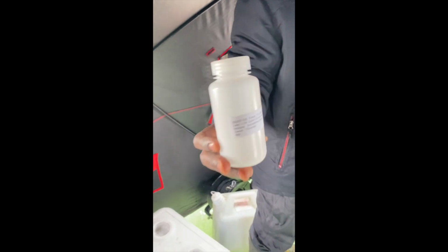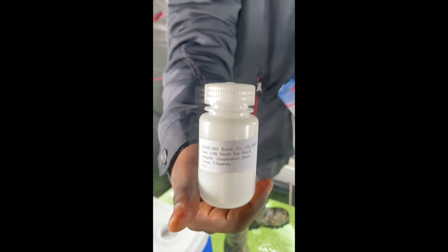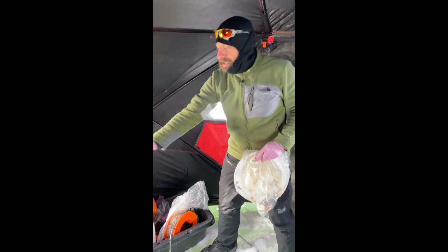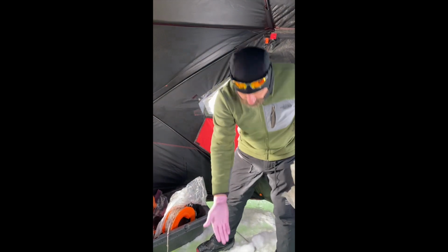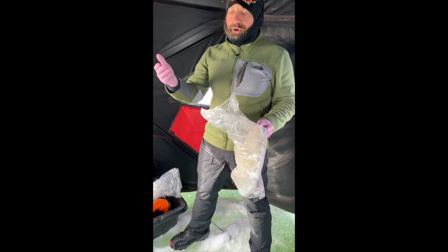We have some bottles, which you will also have for these samples. So again, we do duplicates. Depending on the density of zooplankton, you will do potentially more than 1 replicate tow for each of the duplicates. But even looking here, I can see that there's a ton of zooplankton, so 1 replicate is going to be plenty for our quantitative sample.